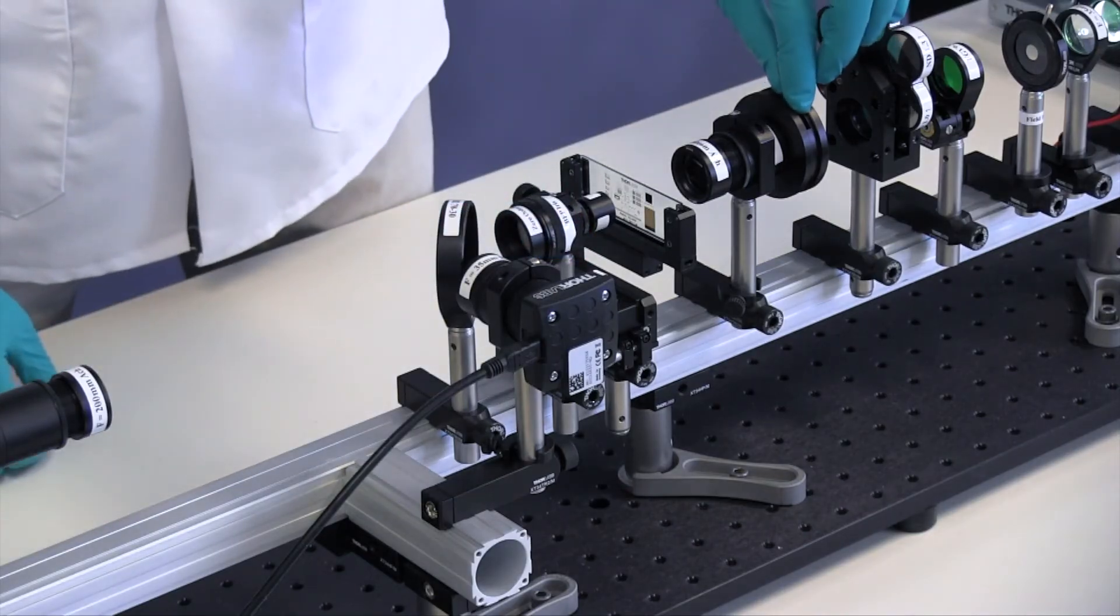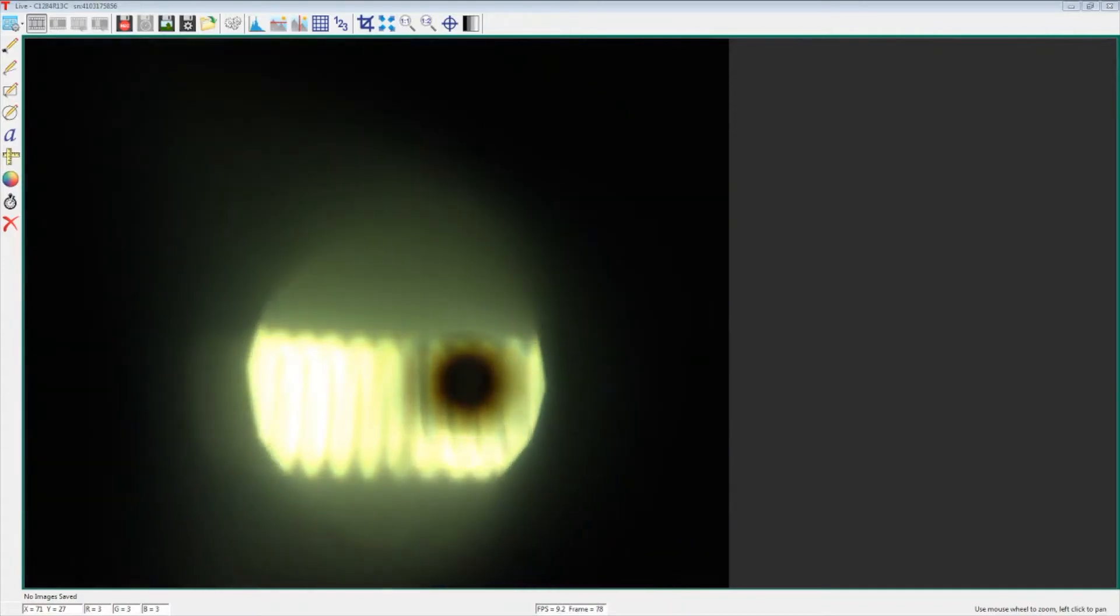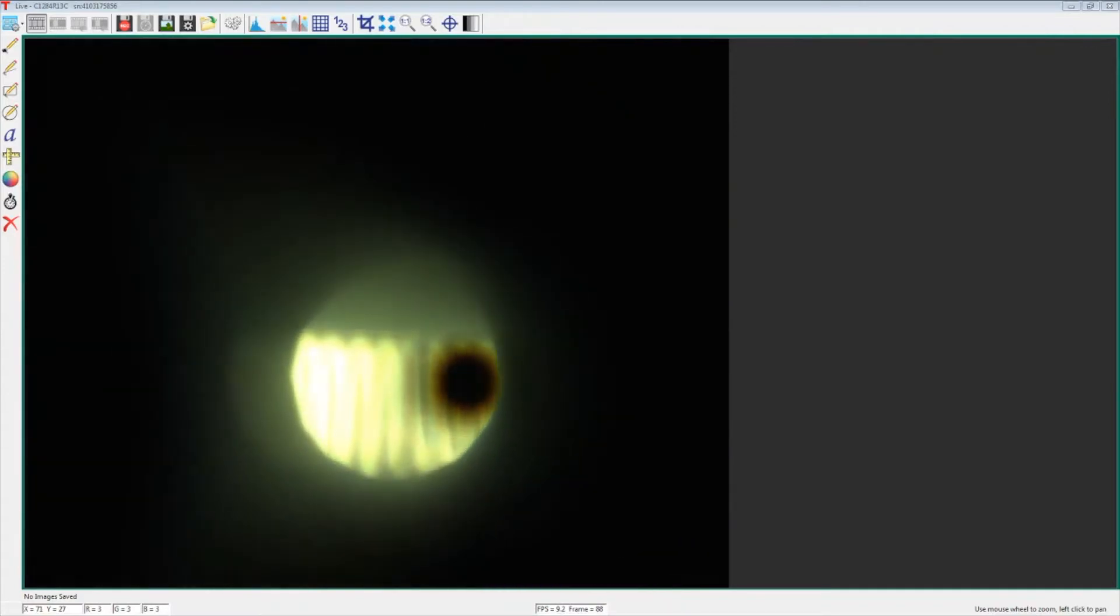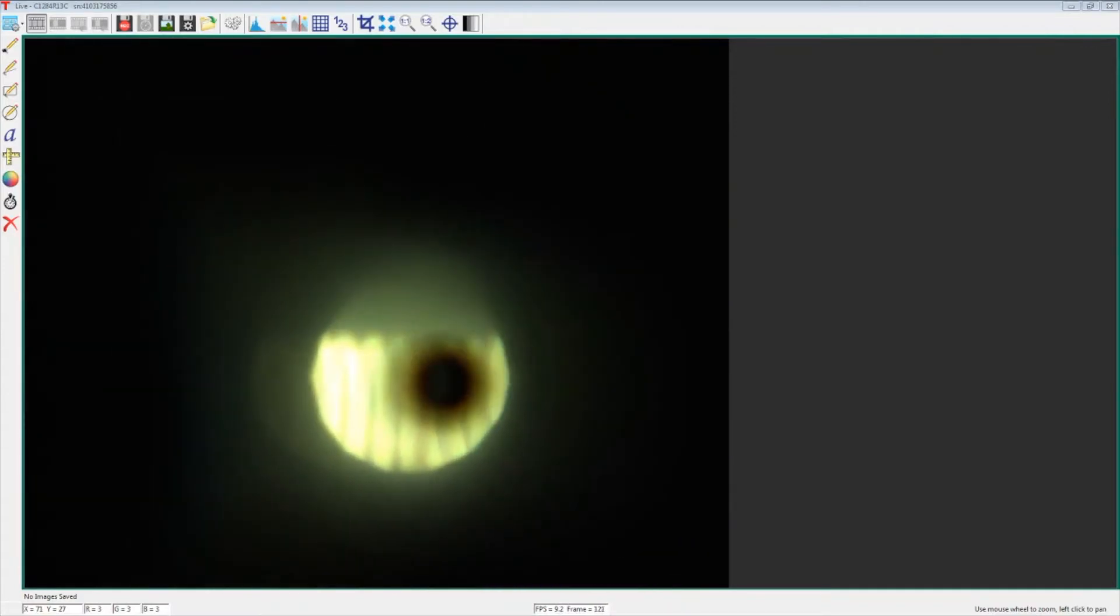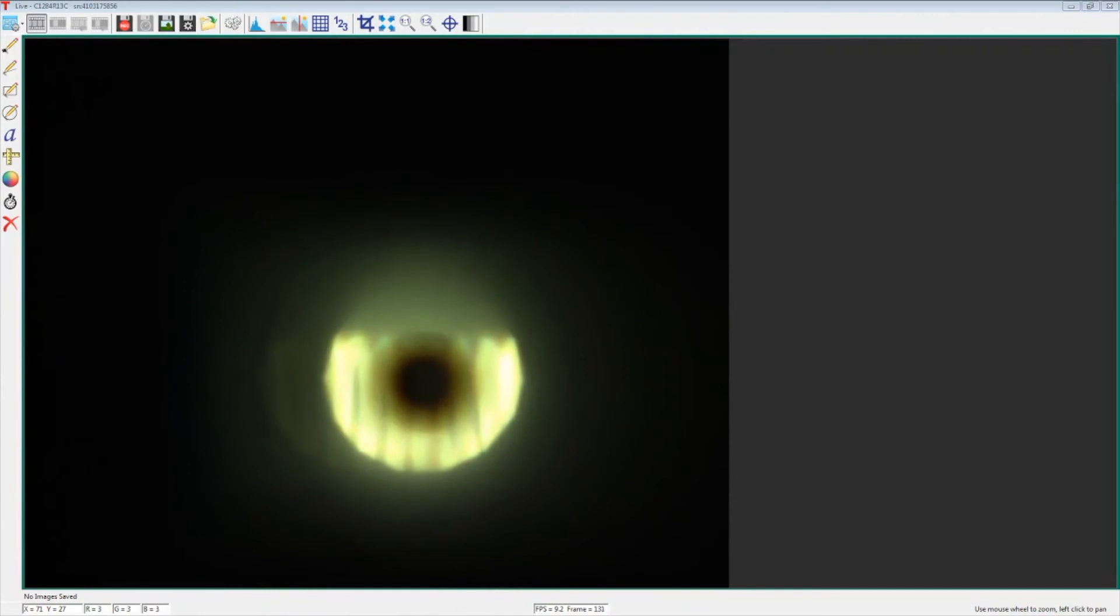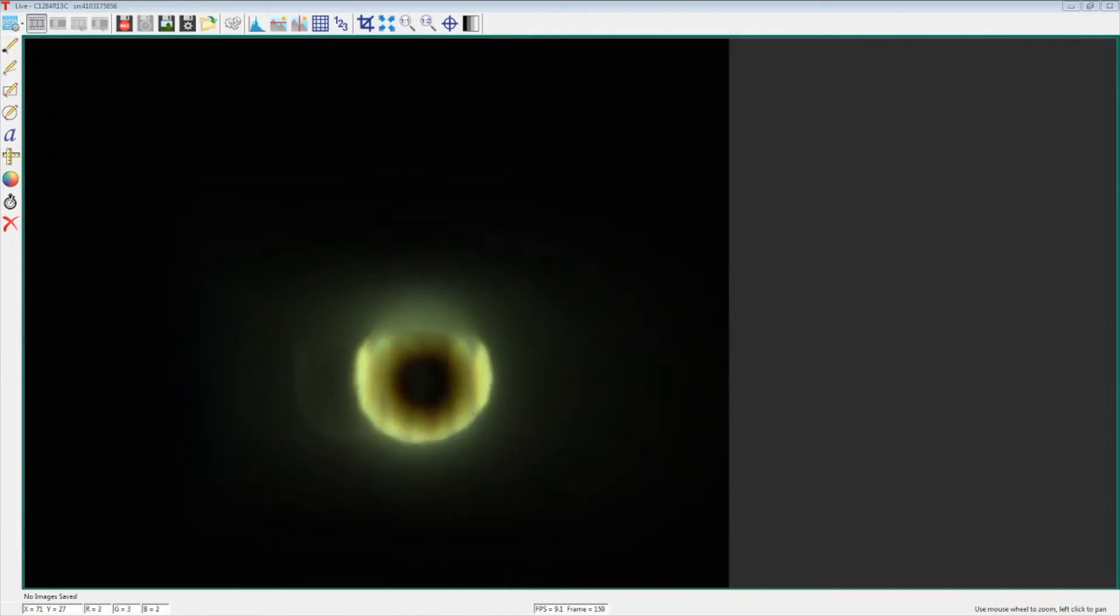Close down the aperture iris on the dot. If the dot is not centered within the iris, rotate the objective to center it.